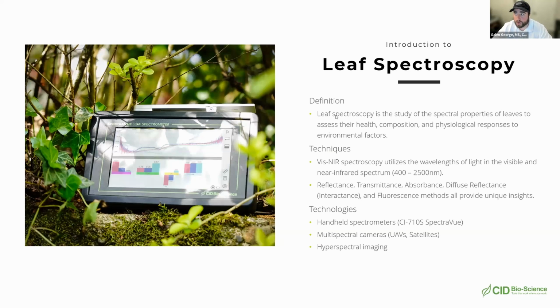But the one thing you're going to want to take into consideration, especially for remote sensing applications, is that for the most part you're only getting top canopy layer images. So when you're taking your measurements for the ground truthing, you want to take them from the same leaves as what would be most observed from your remote sensing application.